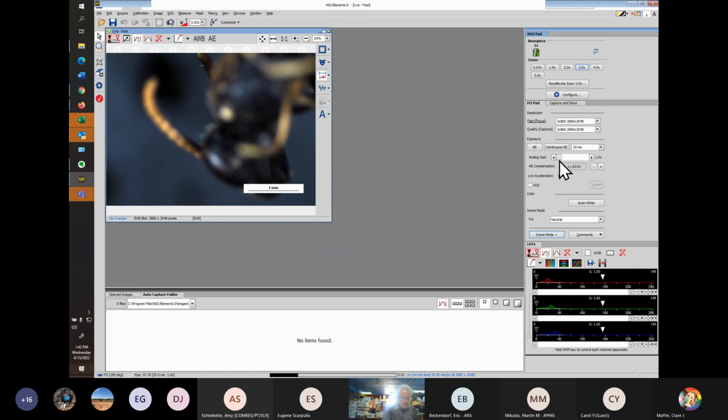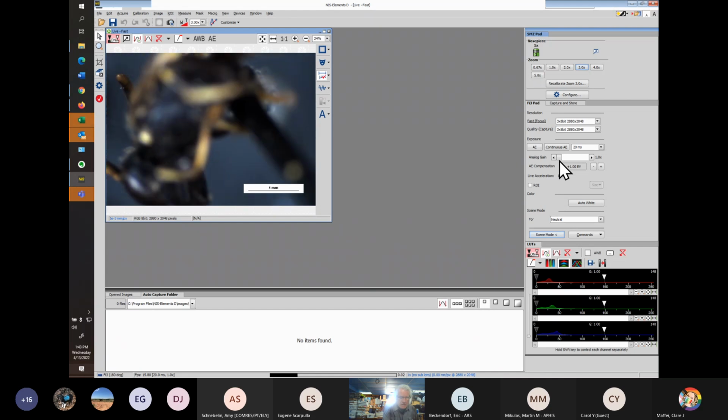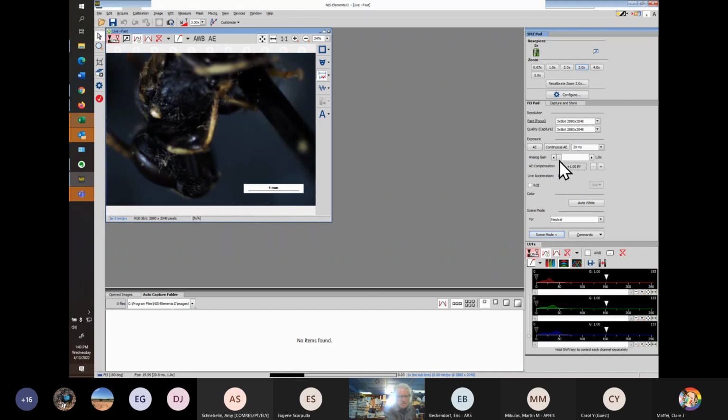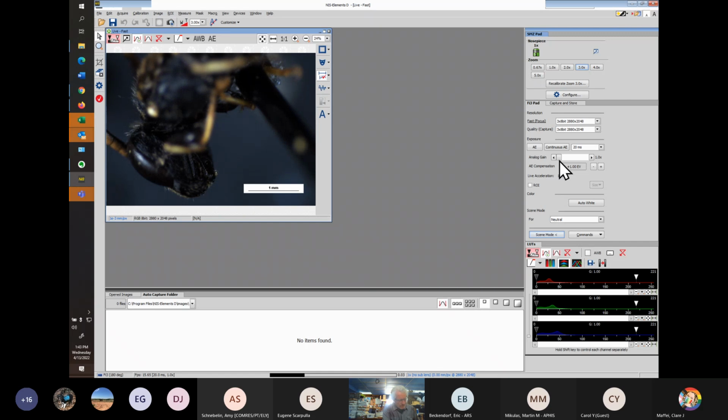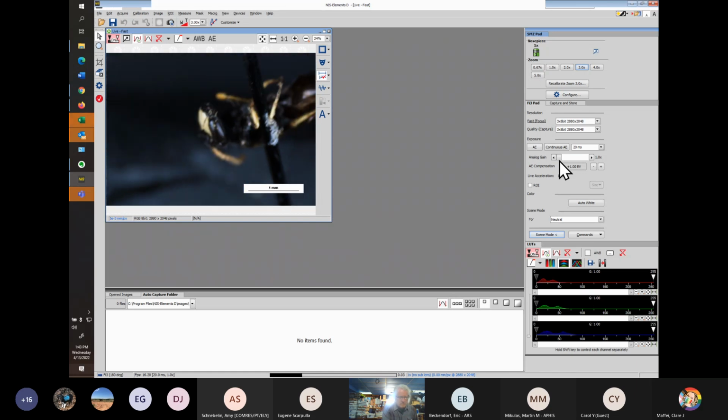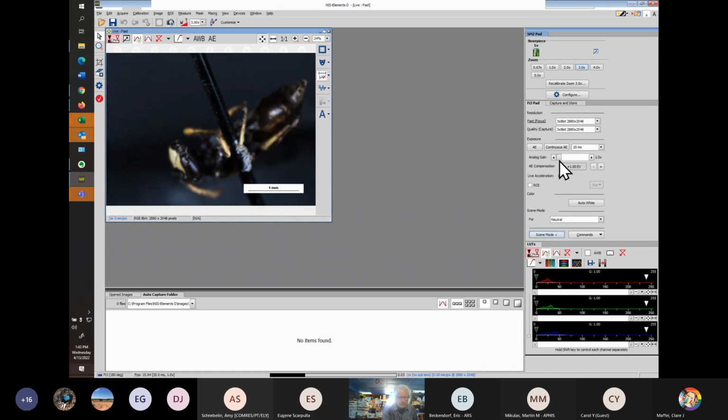However, usually you can see what amounts to S8 on the. That's not showing up very well. Try it completely upside down now. This might work.